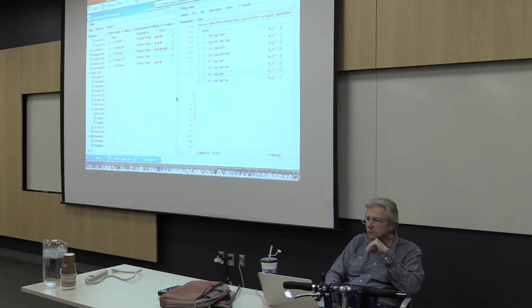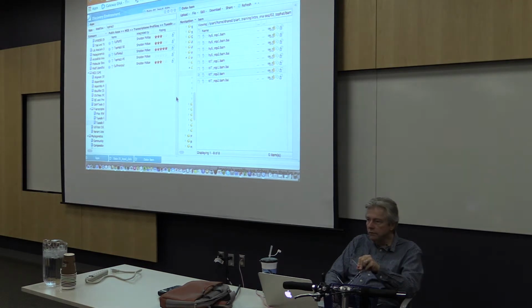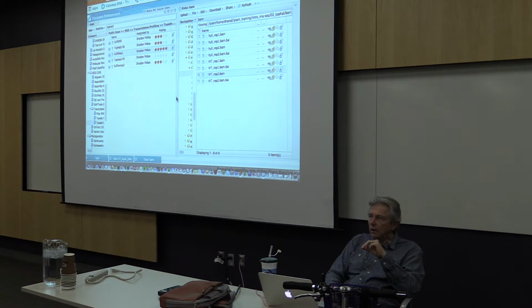Yes? I have another question. I'll stop asking you in a little bit, I promise. No, that's okay. Questions are good. When you were putting in the annotation information, it was just in a drop-down screen. But if we're going to upload our own file, what file format should that annotation be in? Because I know that people will distribute those in tarballs and all these things. Ideally it's the GTF.